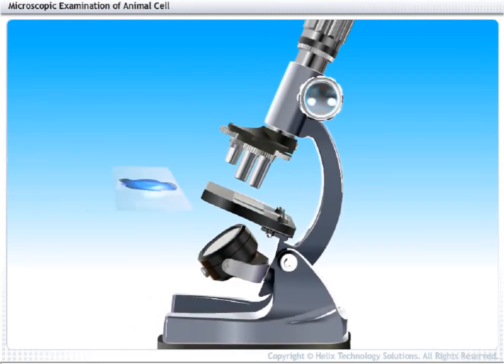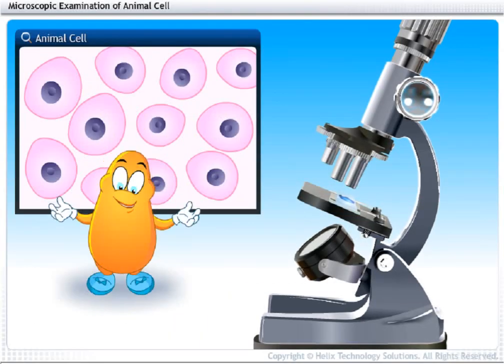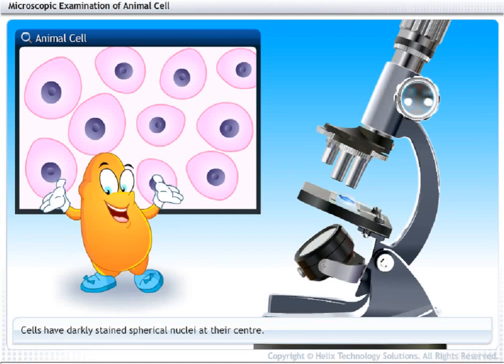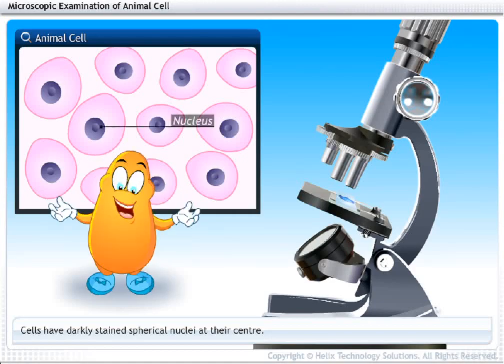Now let's observe the cells under the microscope. Look, these cells have darkly stained spherical nuclei at their center.